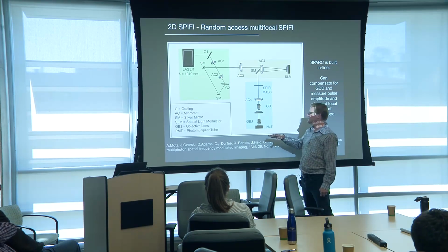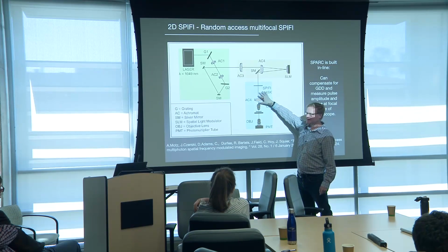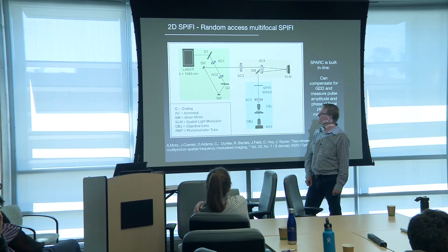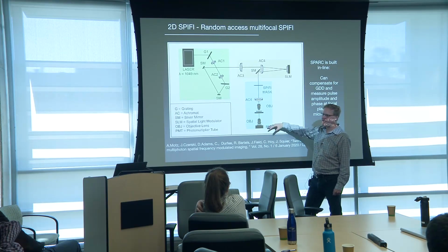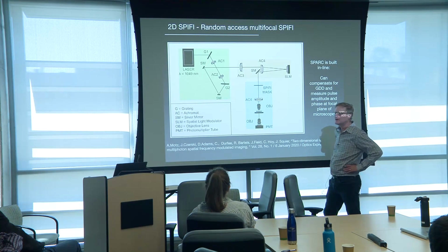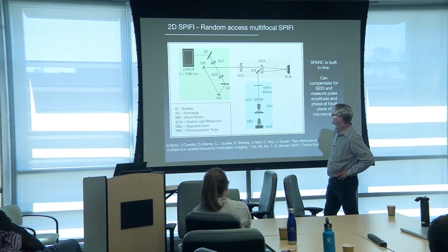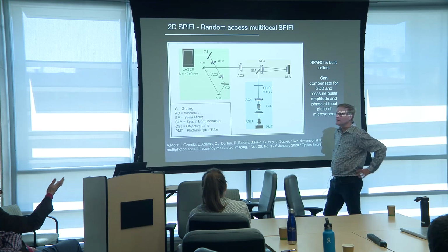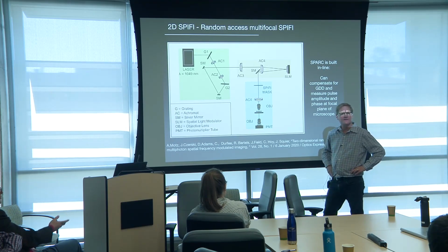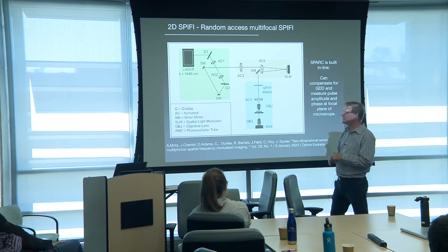That's a fantastic point. We absolutely detect in all directions. You don't need to do this; it's just to keep the schematics clean and show people what we do. We detect everywhere. The money is there. With that modality, we can shoot into a mouse brain and look at stuff, and we're going to do that. That's why I'm excited.